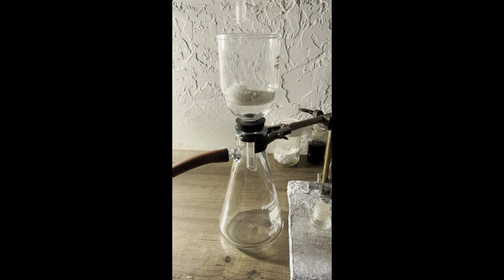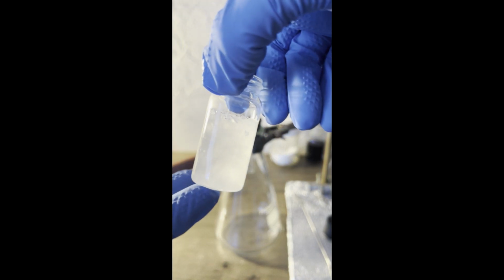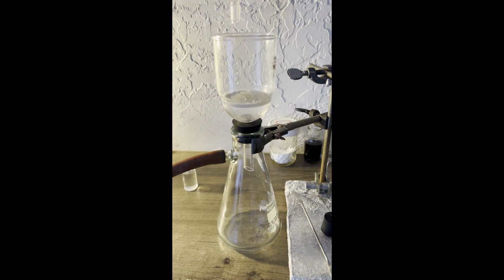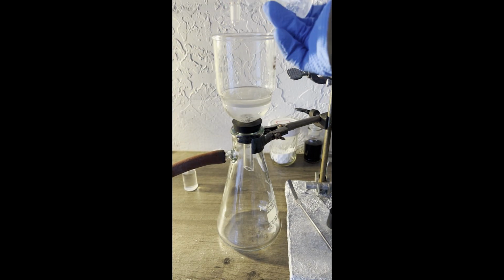What I meant when I said I fractionally froze it is I put the ODCB and PDCB mixtures in the freezer, waited for them to solidify, and filtered them on this fritted glass funnel. At typical freezer temperatures, ODCB is a solid, so the resulting ODCB and PDCB mixture is mostly heterogeneous. The ODCB slowly melts and passes through the filter, minimizing the solvation of PDCB by it. I was pleasantly surprised how well this worked.